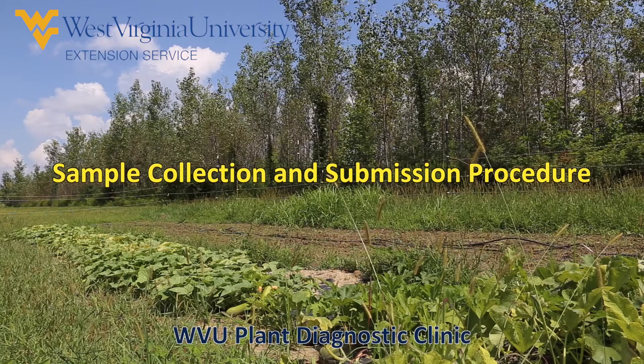This video is a guide outlining the steps to collect, package, and ship samples to the WVU Plant Diagnostic Clinic.